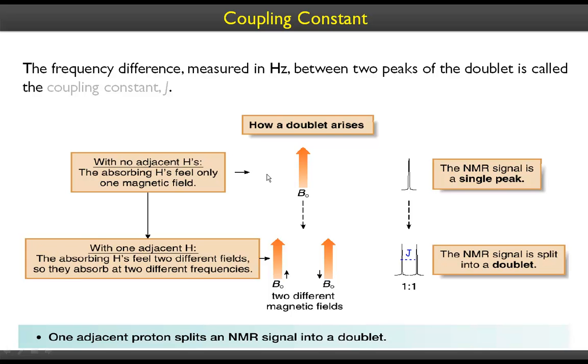And as I mentioned, the coupling constant is measured in Hertz. So this is where the singlet should have been had it not been the case for the neighboring nuclei. Okay, had it not been due to the presence of the neighboring nuclei, my signal should have been a singlet, but because this had 1 neighboring hydrogen nucleus, this is split in 2 ways, and that's the average chemical shift, and the ratio is 1:1. The distance between these is given by the coupling constant.